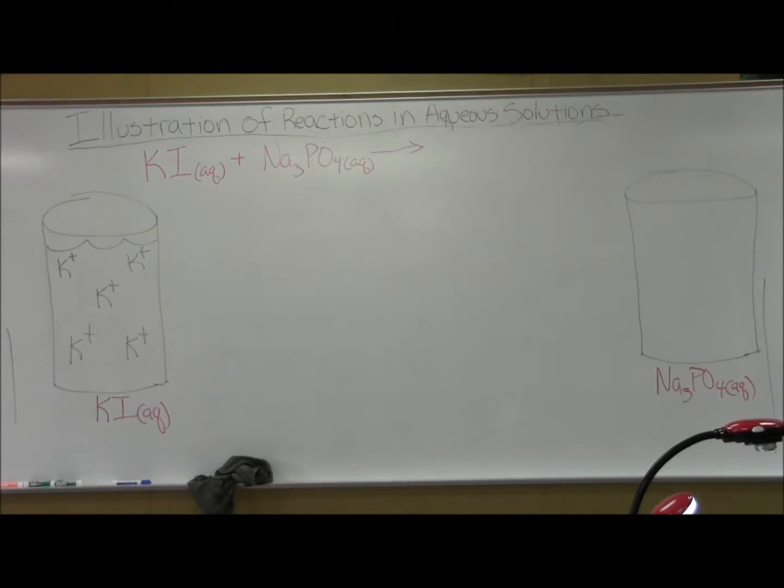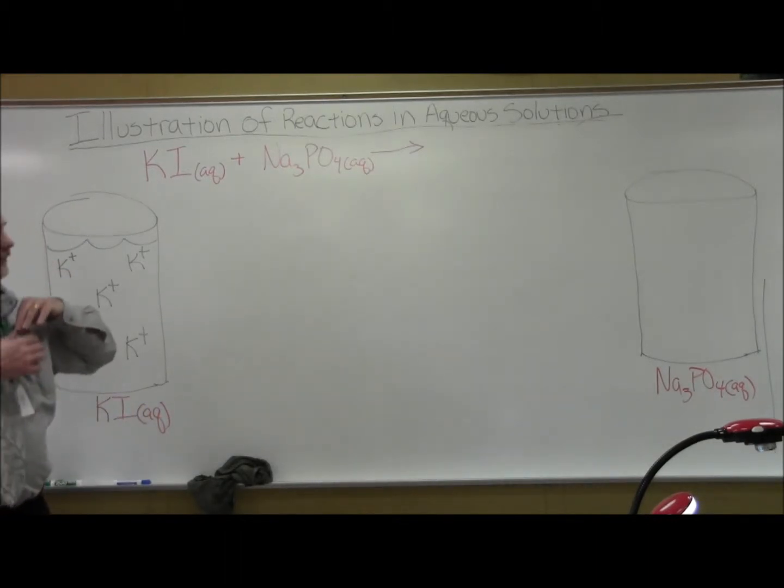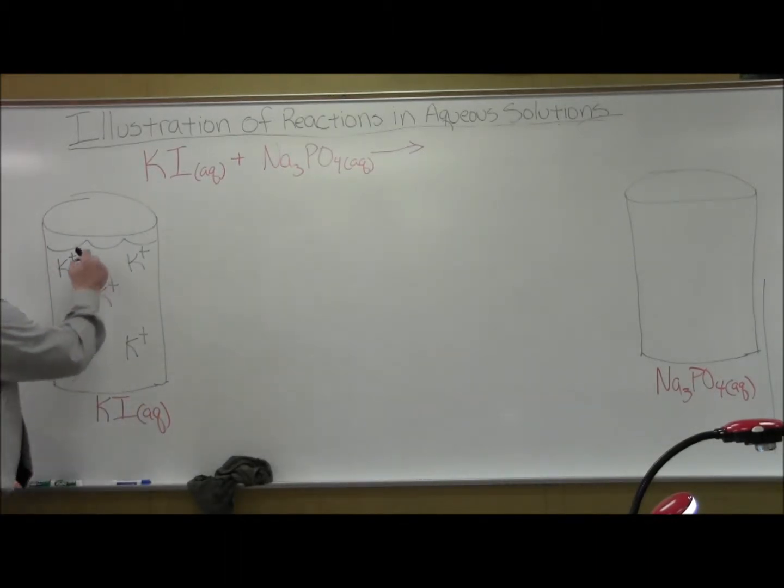And now do me a favor, also have the iodide ions broke apart. 4 or 5.